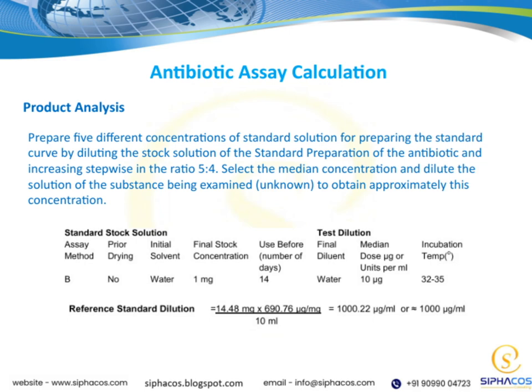Remember, the goal here is to establish a solid relationship between concentration and response, which will ultimately allow us to determine the amount of antibiotic in our unknown sample with confidence. This step is crucial because it underpins the accuracy of our entire antibiotic assay calculation.